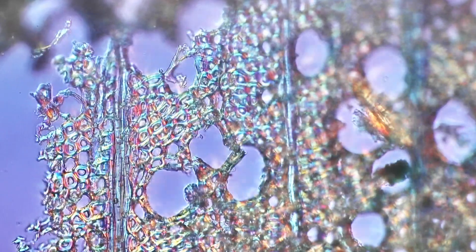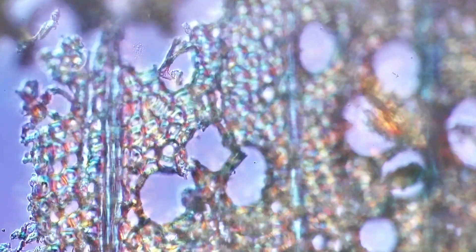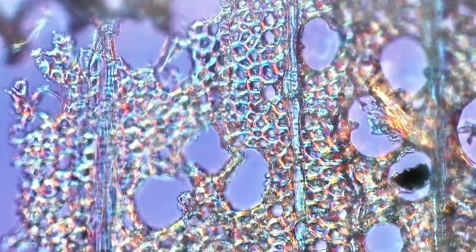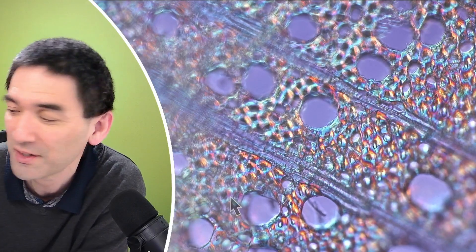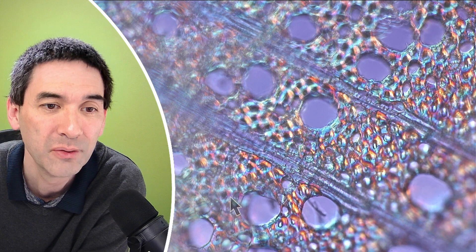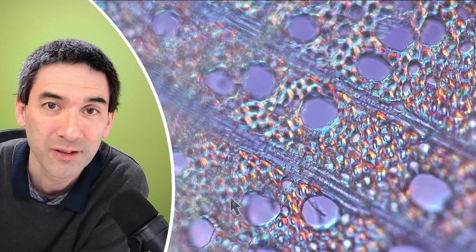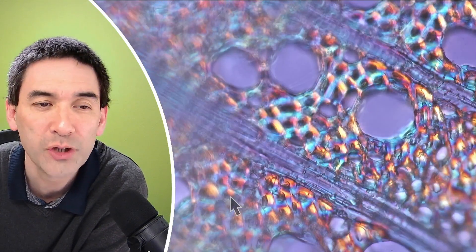I think it's quite a nice one. Unfortunately the specimen is not entirely flat. For this reason I have to refocus a little bit, some parts are a little bit out of focus. But let's go up to the higher magnification. Here we go, 60 times objective.